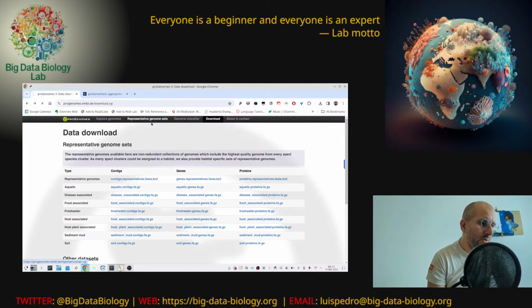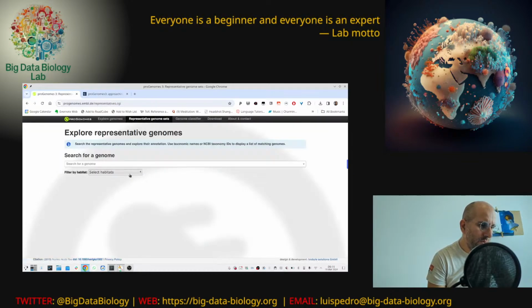What I would want to do is download the genomes, but not just the representatives.